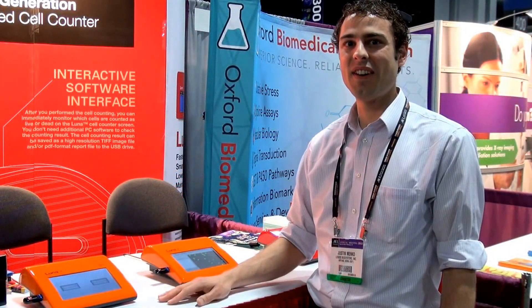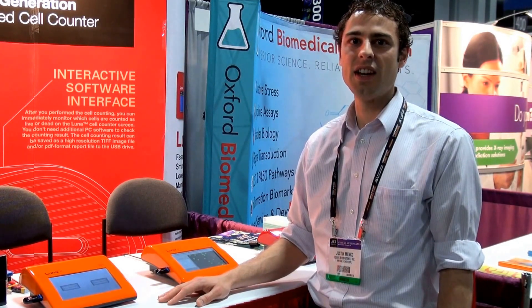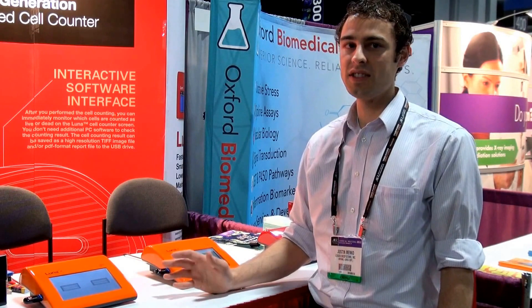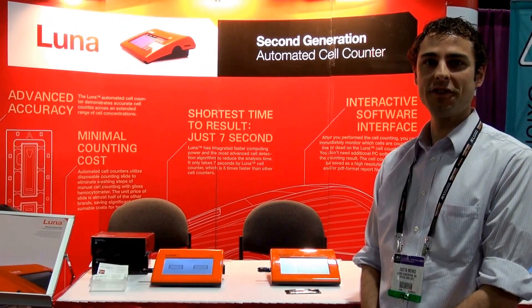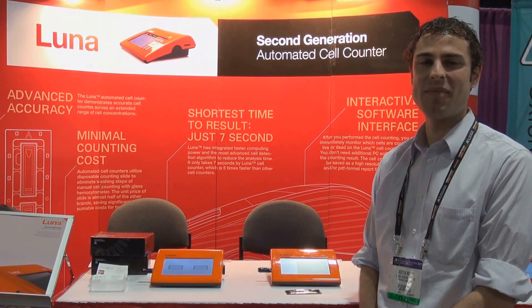In summary, the Luna FL is an automated cell counter without cell counting limitations. It can count blood cells, primary cells, yeast, and standard cell lines all in one affordable package. For further information or to request your demo, you can go to logosbio.com. Thank you.